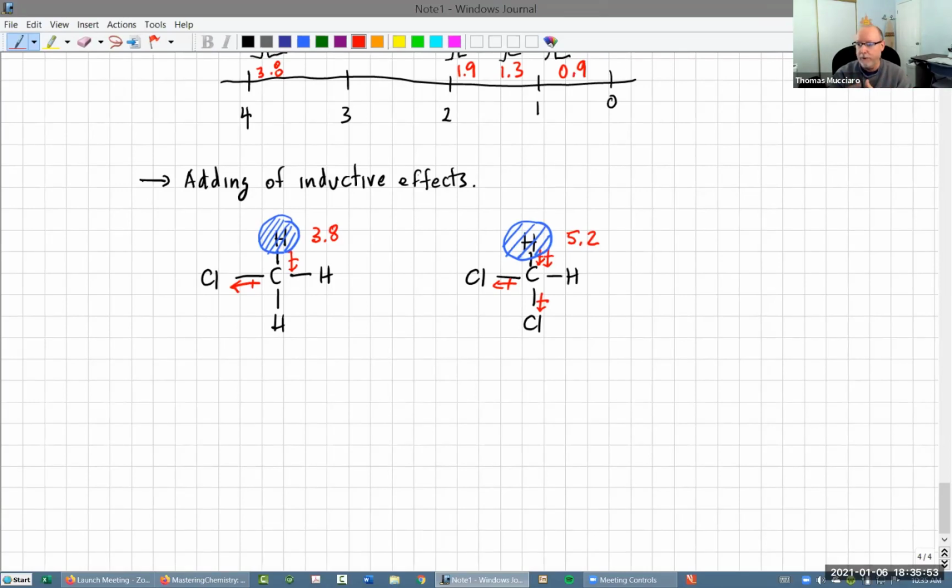It doesn't account for what happens if I have 2 chlorines pulling, right? It doesn't account for the fact that these add up. And so you're not going to have an entry exactly where that peak is, or that peak is going to come here, but it's not really for this thing. It's for 2 of another thing. Okay. So that's the thing.